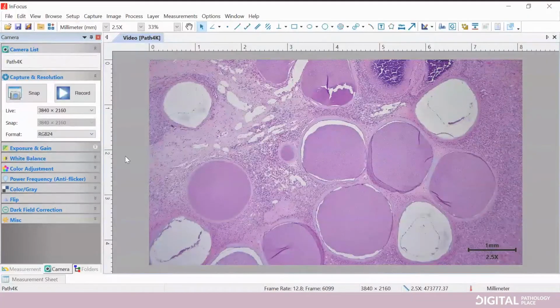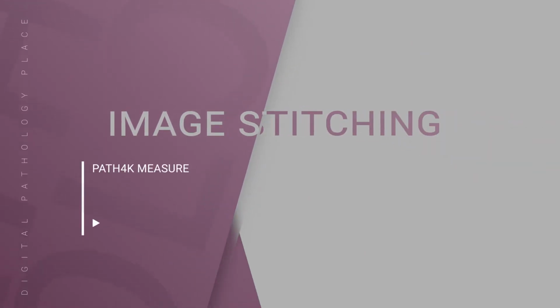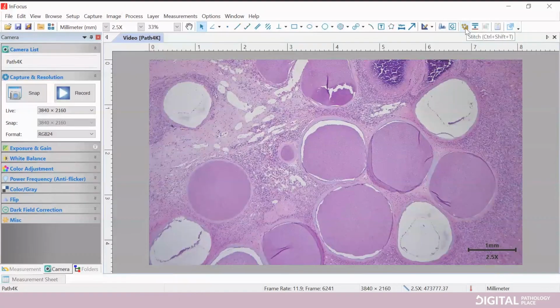All right. So Alex, you had asked about after we showed you the counting, we talked about some more in-depth image analysis, and going back a step actually to talk about a way that we can increase the ability to do better counting across larger fields of view. So again, I understand that in some cases you're going to want to just count based off of one field of view at a certain magnification, but just showing you a feature, whether it's for counting, documentation or publications, this software has stitching, XY stitching, or mosaic or live image builder, whatever you want to call it, but it's free and included in the cost of the camera with the software.